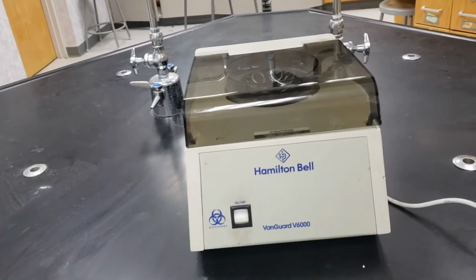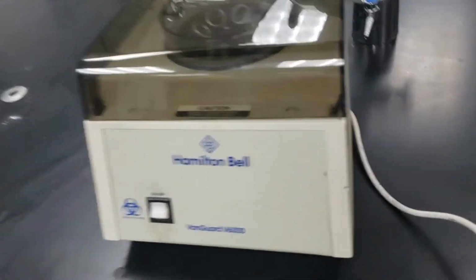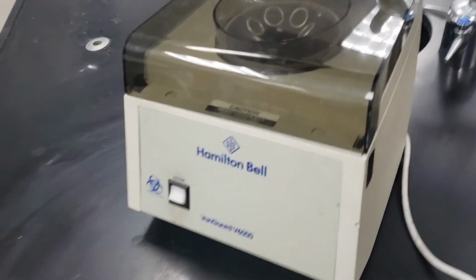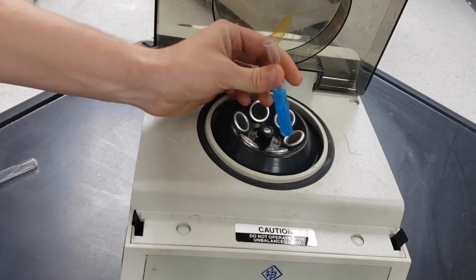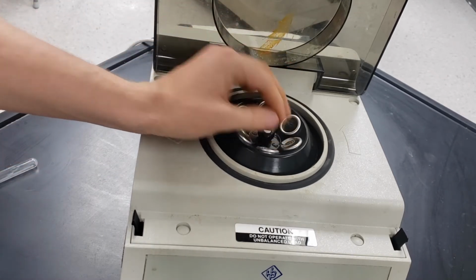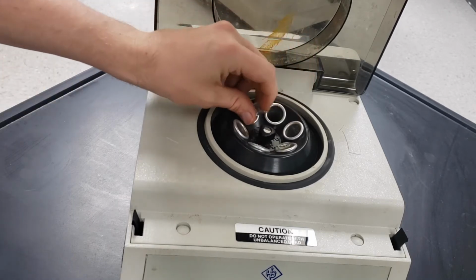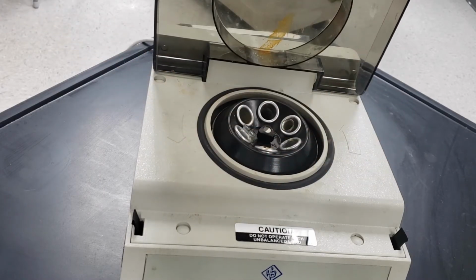You might have seen your doctors use something like this. It's a centrifuge. And if a chemist is unsure whether or not something is a solid, we might spin it really, really fast and figure out if it's a solid that way. So let me get my phone up so I can use two hands really fast. One second. All right, so again, here's the before. I'm going to load that into one side. And then opposite of it, I'm going to add some water as a ballast to make sure this thing isn't unbalanced. If you think of a washing machine, if you just put something in, it's going to shake itself apart.